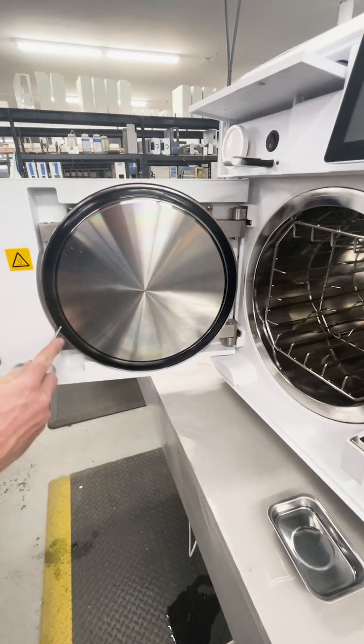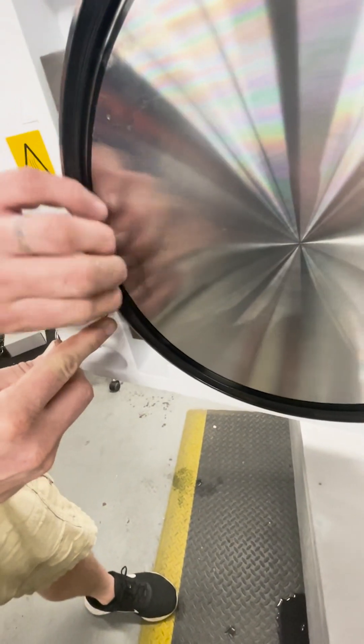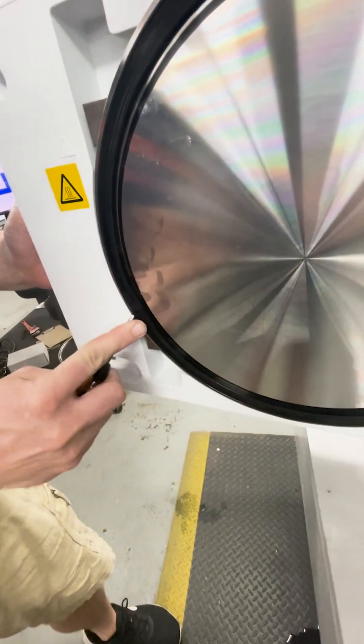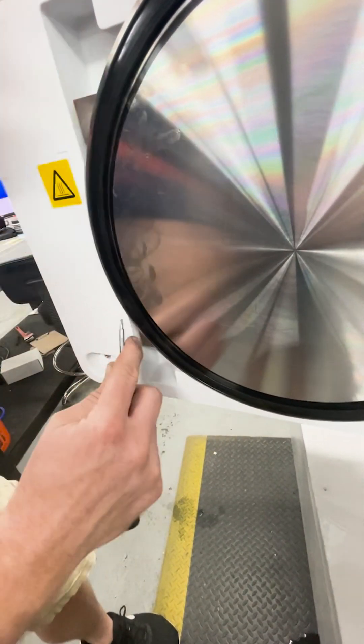To remove the old gasket, I'm going to use a small flat head screwdriver. Get right on the back side of the seal — you can pick anywhere — and it'll just kind of pry out once you get it started.